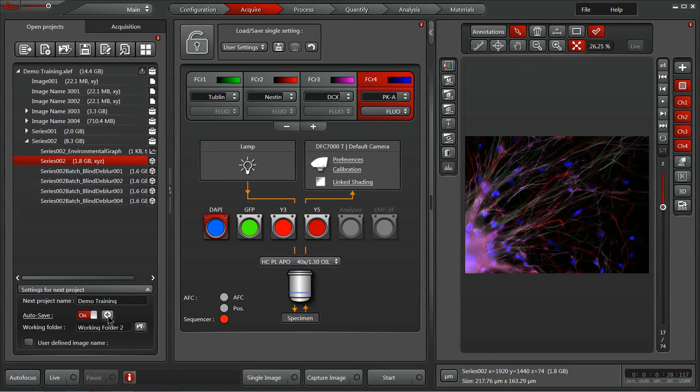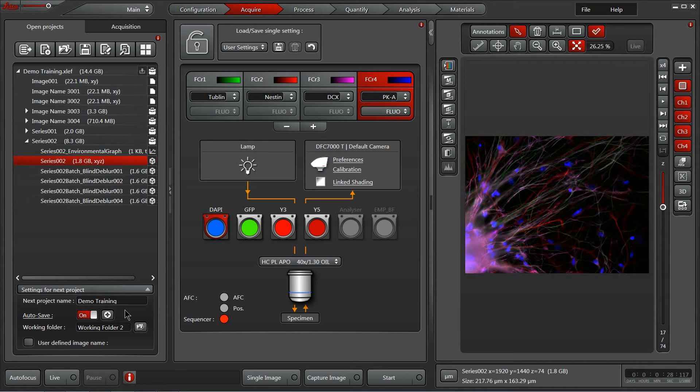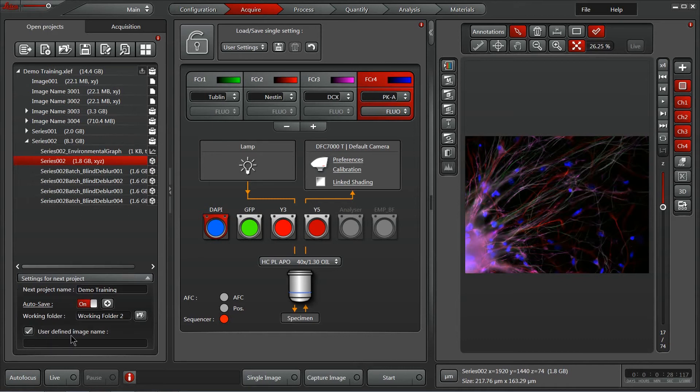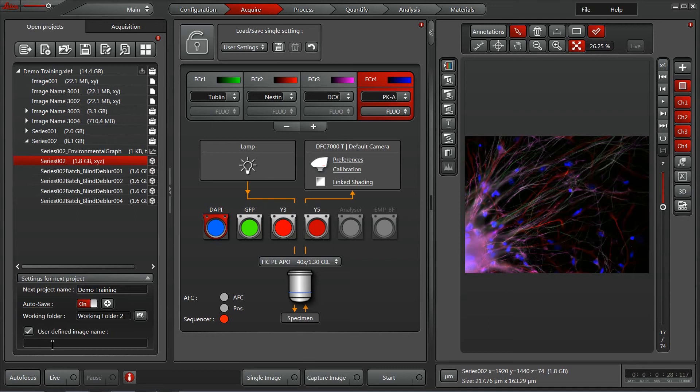If you hit this plus sign, you can also get access to the folder tree wherein all that autosave data is going to be saved for you. On the bottom, you can also activate a user defined image name. So, rather than having the default image name 001, you can actually put a sample specific name to help you keep your data nice and organized.